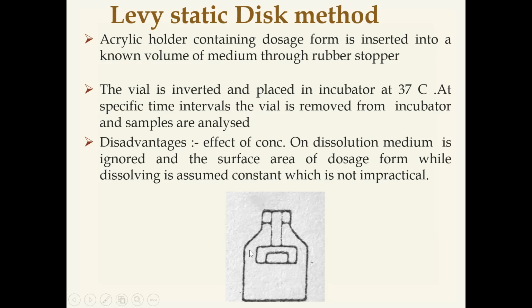This consists of an acrylic holder, on which the dosage form is mounted. And this total assembly is inserted through a rubber stopper into a known volume of dissolution medium. Here we are using 25 ml of simulated gastric fluid as the dissolution medium.